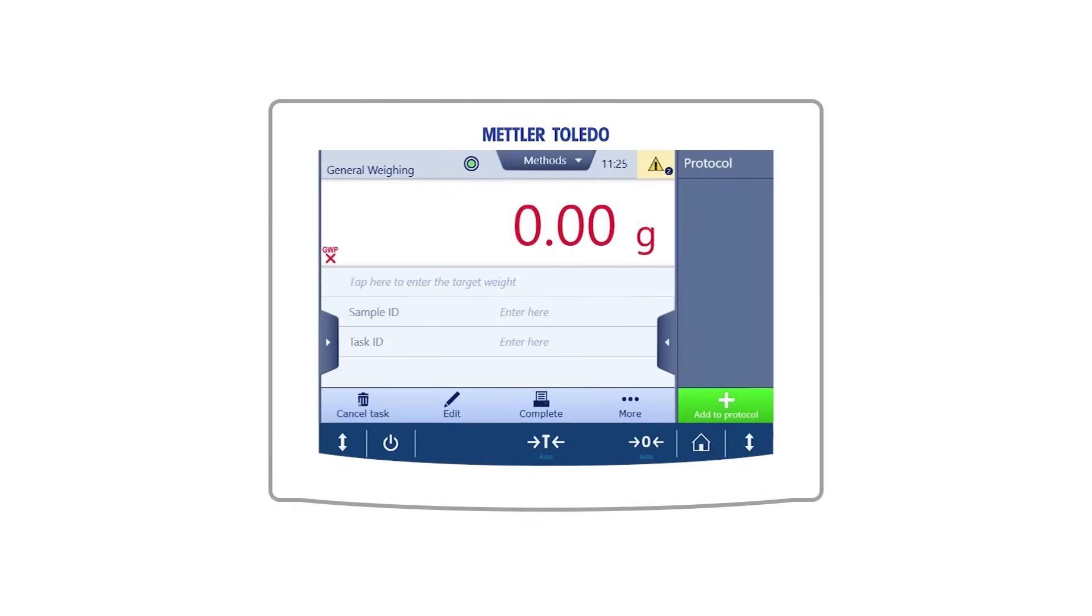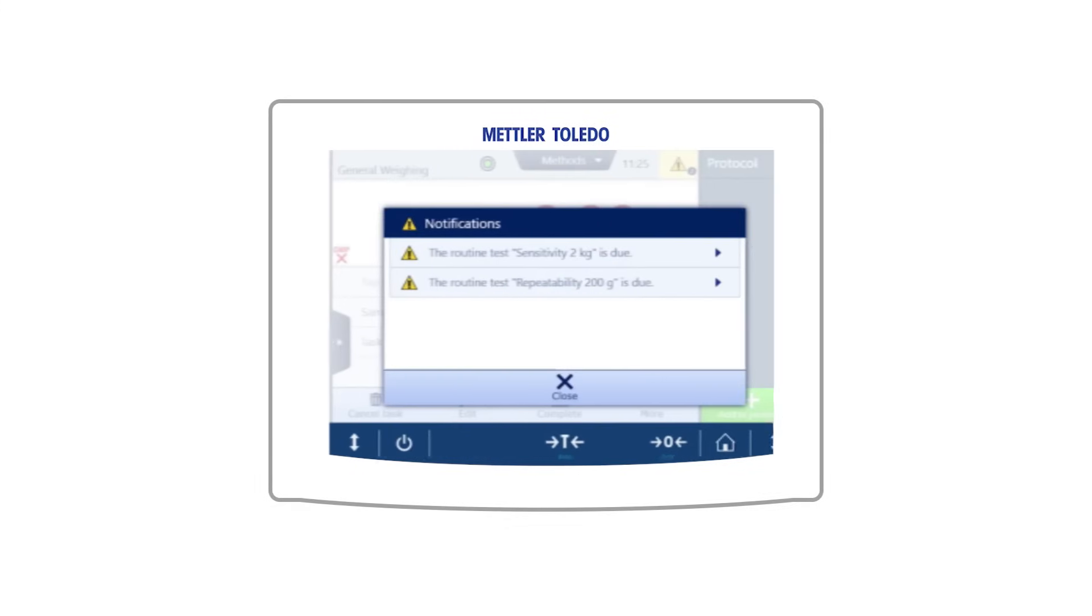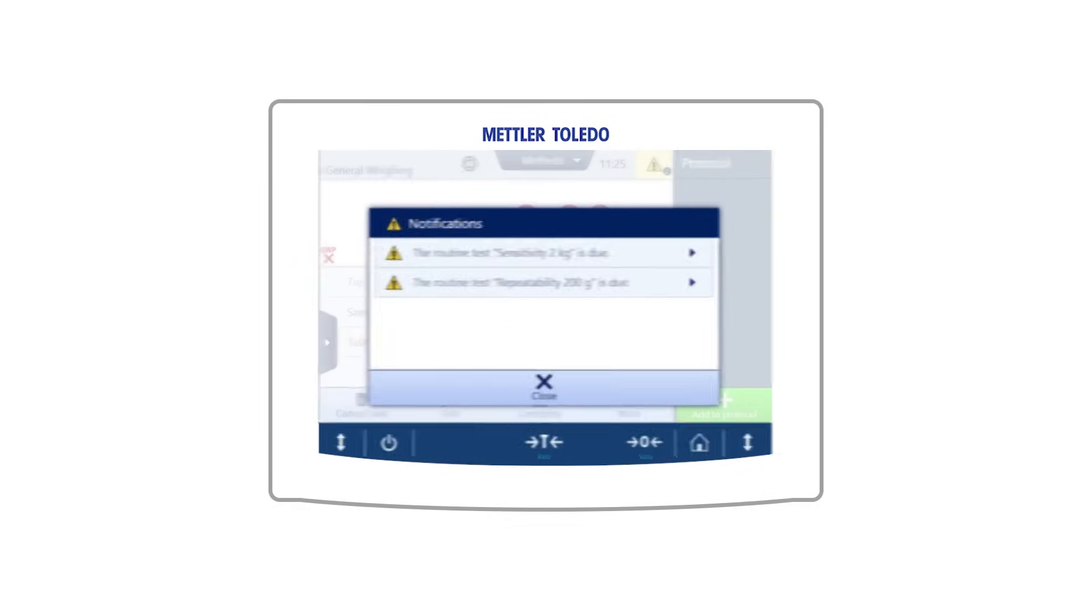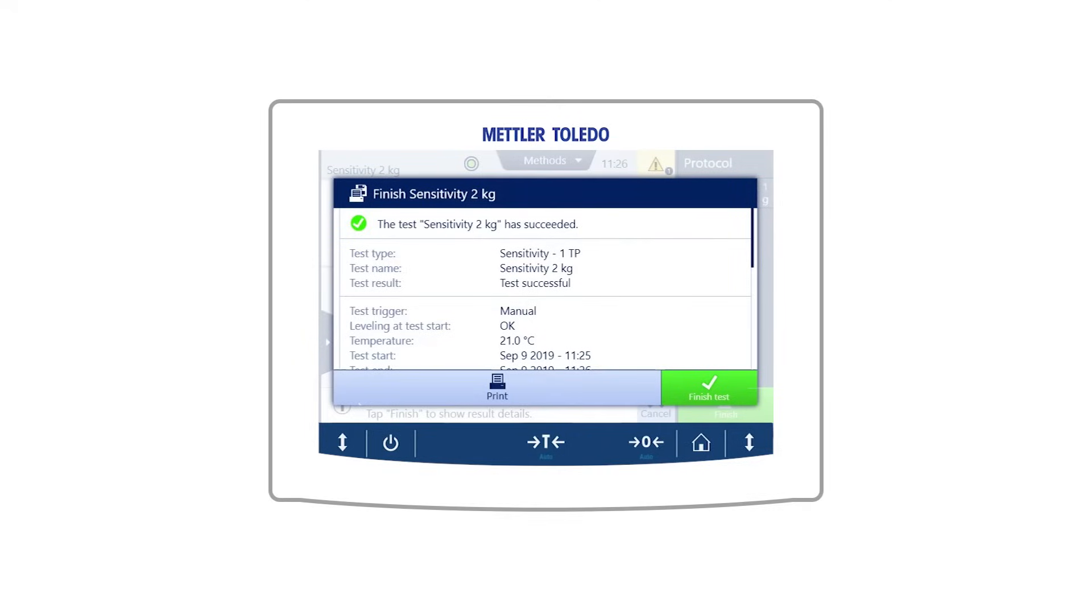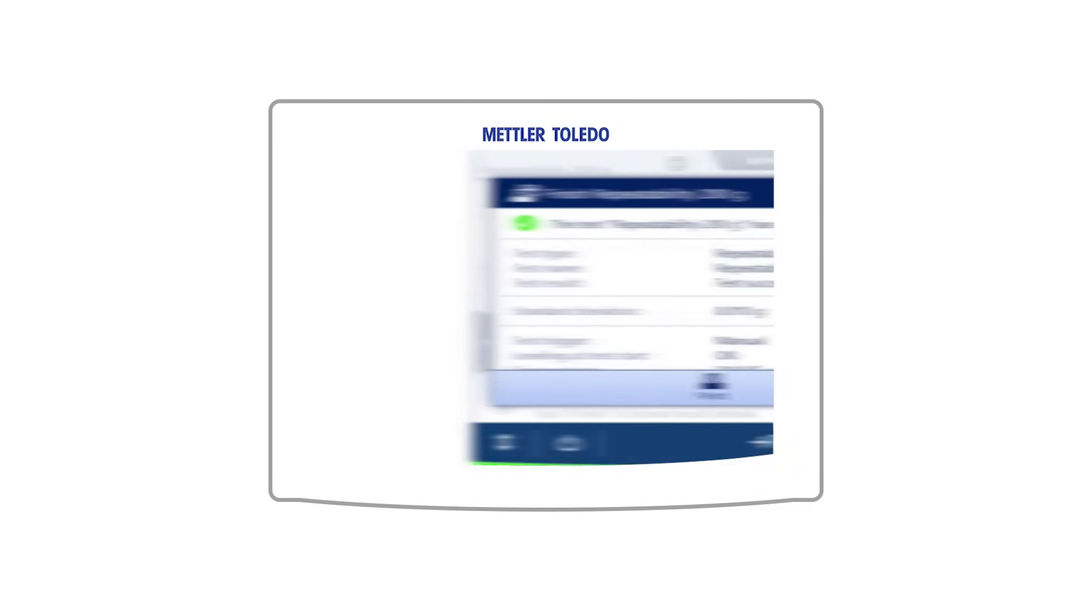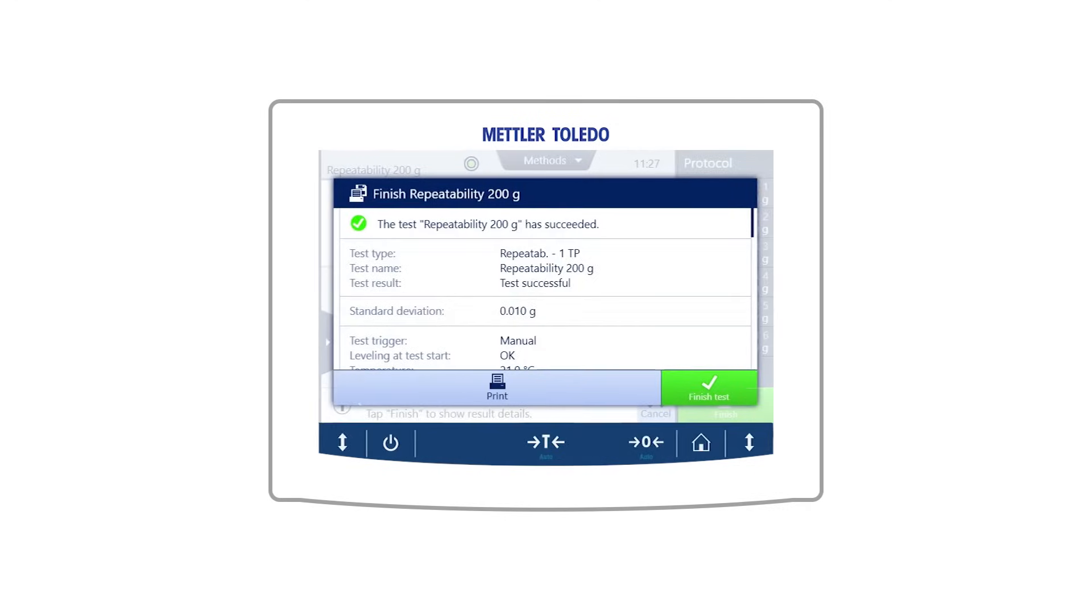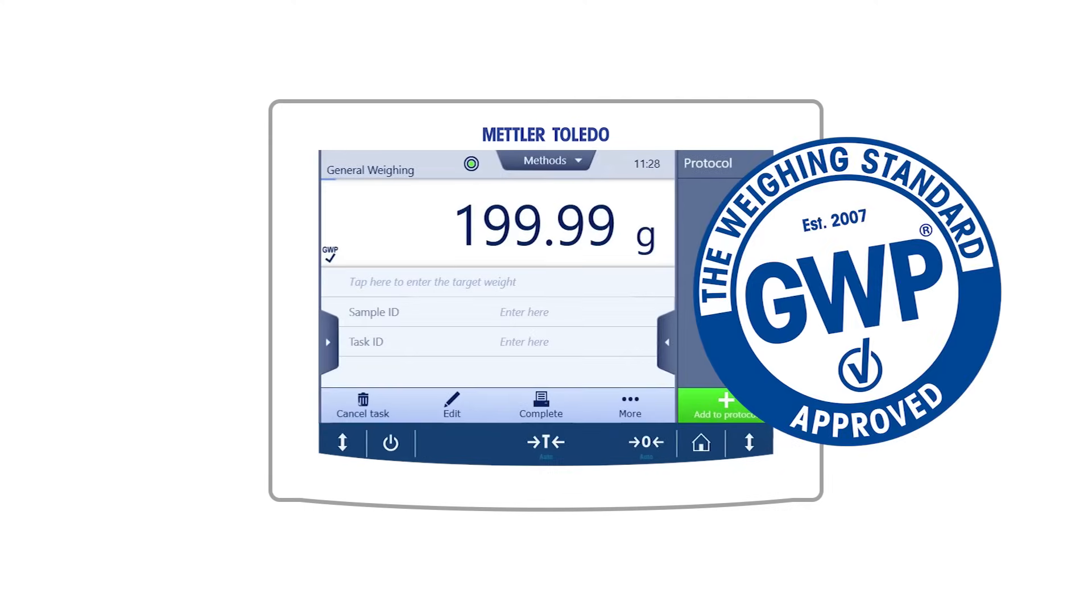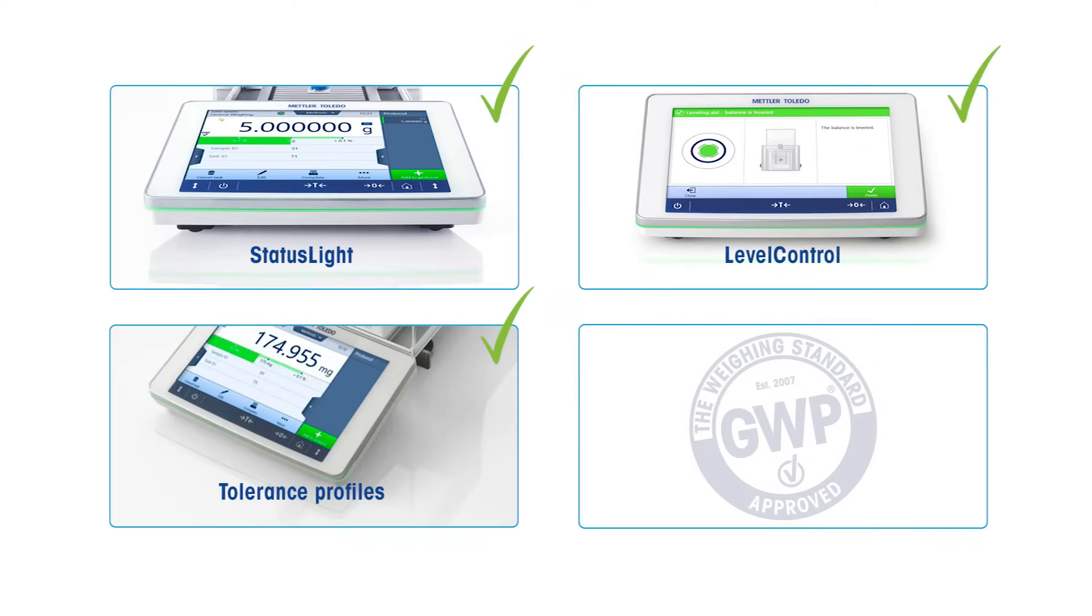Last but not least, there is the exciting new GWP Approved function. GWP Approved actively monitors the balance status and all relevant conditions for accurate weighing. The icon shows you that every single one of your results is valid.